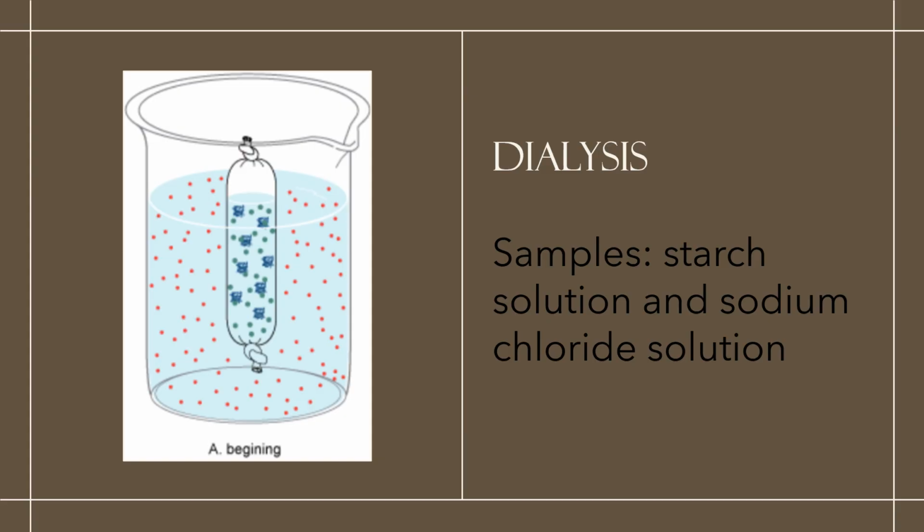Okay, and so again, we utilized your sample, the starch solution and sodium chloride solution. These ones are placed inside the cellophane. And yes, after 1 hour of standing, we tested for what is present inside the cellophane and what is present outside the cellophane, or what is present in the dialysate.